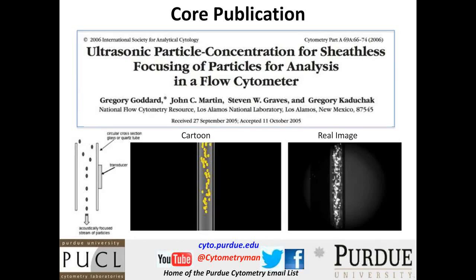But as you develop technologies, as I will explain to you in a moment, things don't always work out the way that you start. Here is some more material published by Greg, and I want to show you what the effect of this transducer over here is. And on this side, there's a cartoon, and on here is a real image. This is actually originally a video, but I couldn't show the video on this system, so I broke up the video into some small sections.